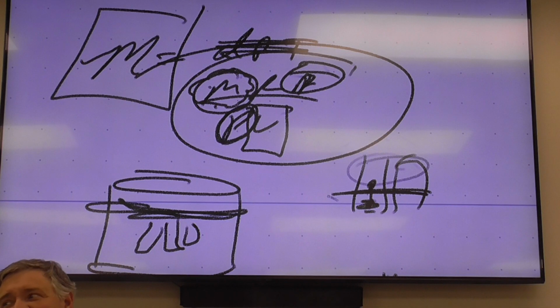So there's a whole bunch of errors that can happen. There are so many things where this can go wrong. Because you're dealing with such small quantities, if you get one extra drop of water, you dry it off completely, and you have water on there, that immediately turns it into a train wreck, okay? So here's the first thing you need to do. I cannot emphasize this enough. Find the masses of them dry. Get your hot water bath going.